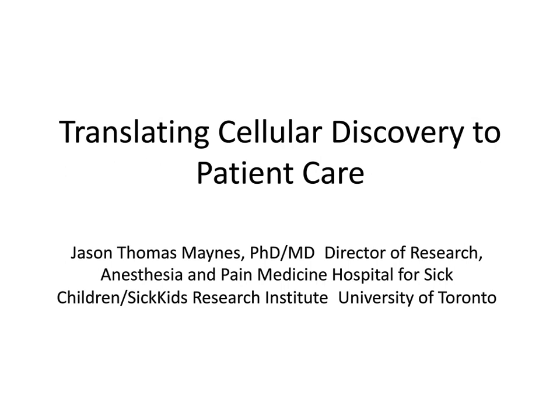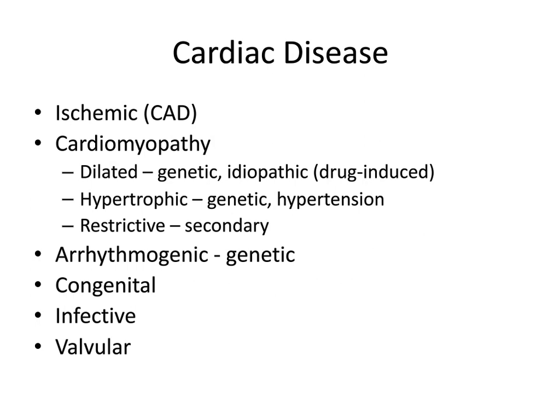Because as you've heard, there's many different ways to look at therapies at the cellular level, but cardiomyocytes don't exist as isolated cells in the body. They exist as part of a collaborative organ, and so the therapies that you develop need to work at both the cellular level but also within the context of the organ. And so we have to better model those diseases in order to make the therapies that we develop actually work in patient care. And so that's something that my lab does in particular, is designing new models of cardiac disease and then looking for either protein or small molecule type therapies for those diseases.